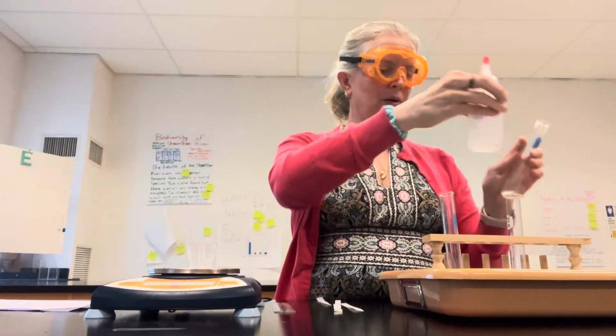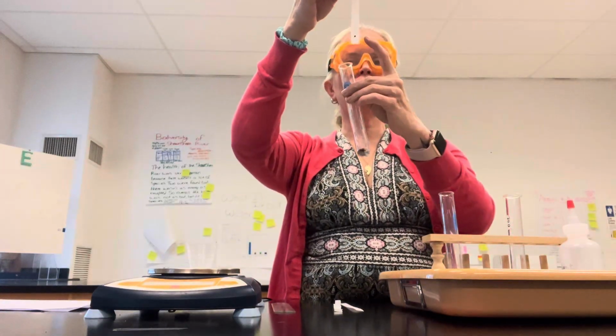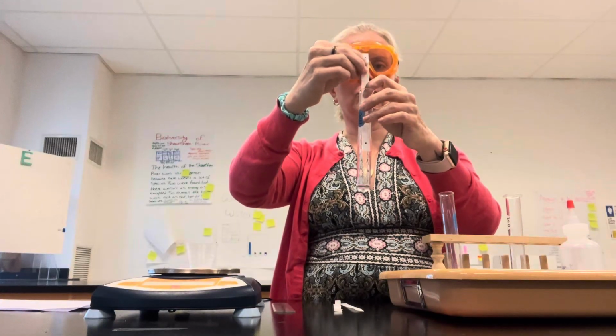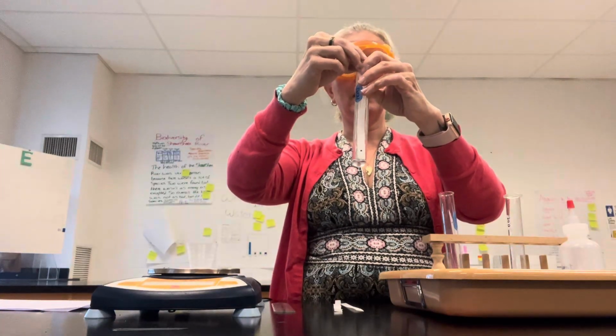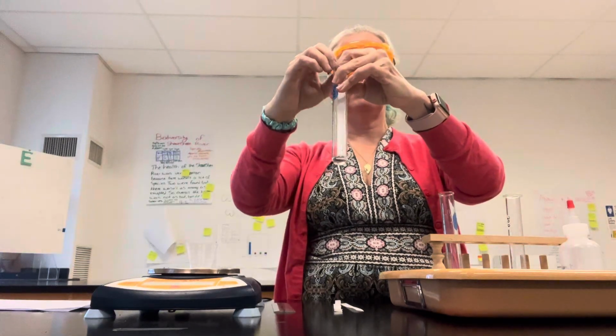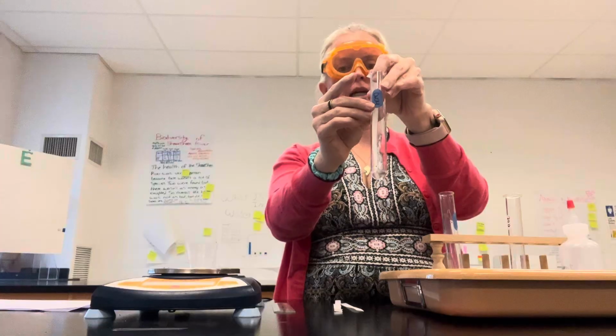And the important part is, I will show you, when you add the paper, you want to make sure the ink stays above the liquid line. So you could do this in your test tube rack, but I just want to show you that I want the paper to touch the liquid, but I don't want the ink to be underneath the liquid. So I'm going to fold the paper over at the top so that it stays.